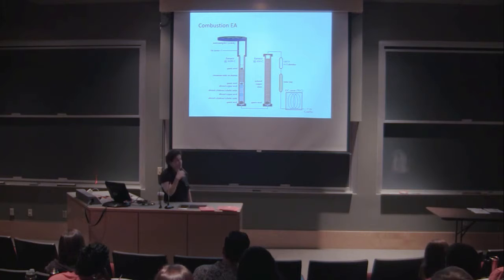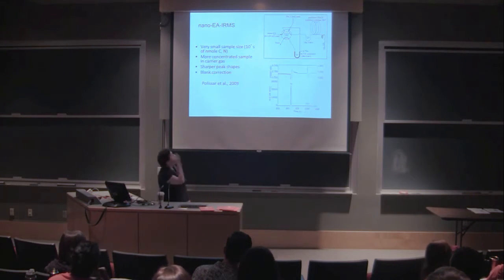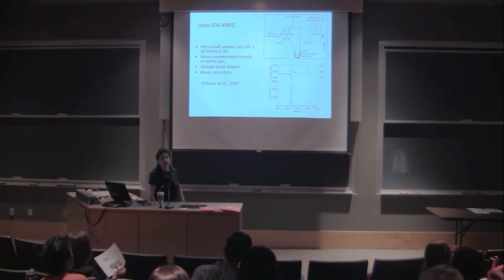And I'm interested in going as small as possible. So we work kind of in the opposite direction of the trend that the market was taking the instrument manufacturers. So we decided to build our own instrument where we could put in small, tiny samples here, and then collect them, and then re-chromatograph them in order to get very, very sharp peaks of a small amount.